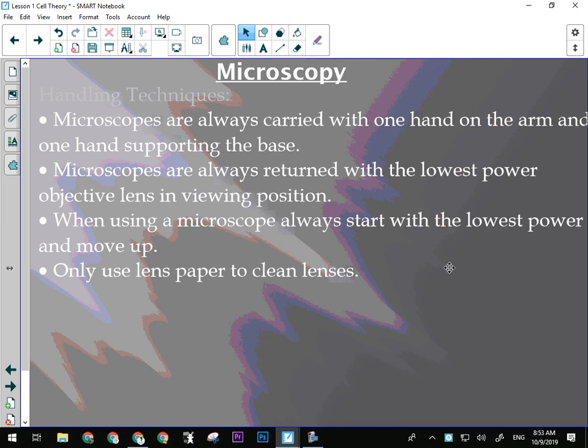Okay, turn it in the same direction, it moves the stage the same way, and you'll be able to get it into focus after that. All right, because there are some times where you hit the brake and you're this far from being focused. Okay, grab the fine focus knob and you'll be able to get there.